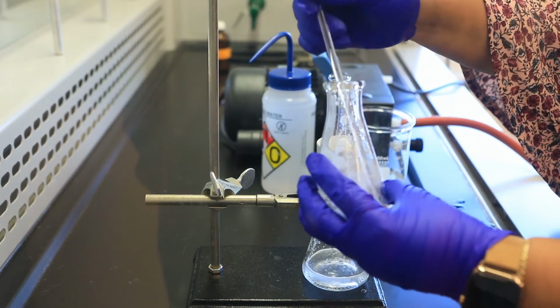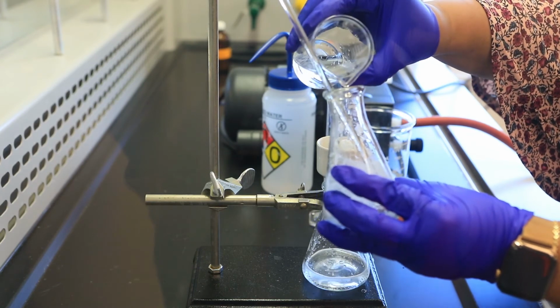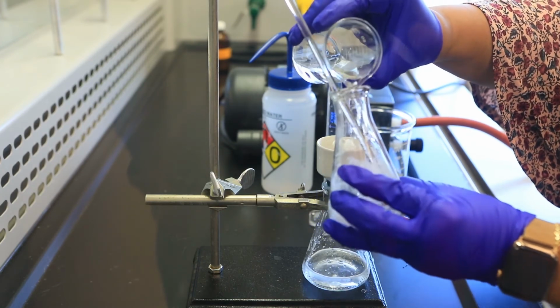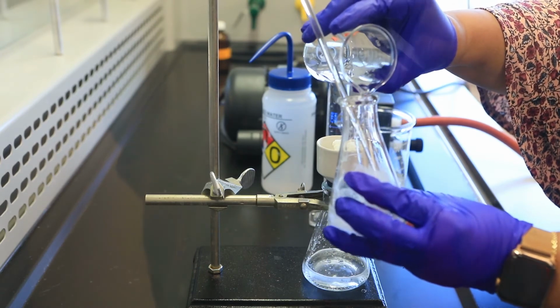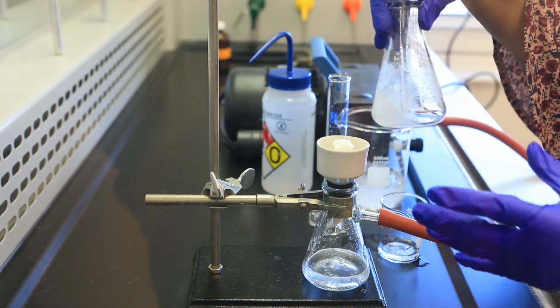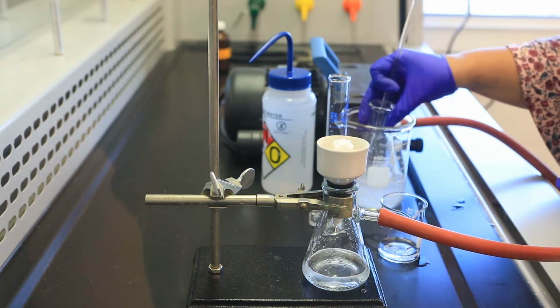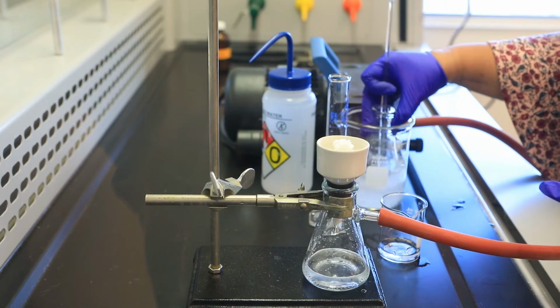And so to remove that solid, I'm just going to add a few drops of cold water. Make sure it's cold water, because if I use warm water, it's going to start dissolving our crystals. If you want to be very careful, you can actually just chill this for a minute or two, just to make sure we get some beautiful crystals.